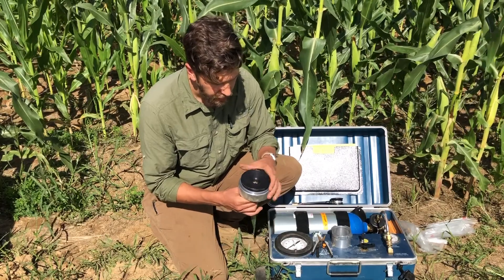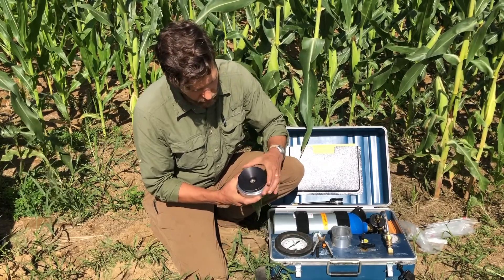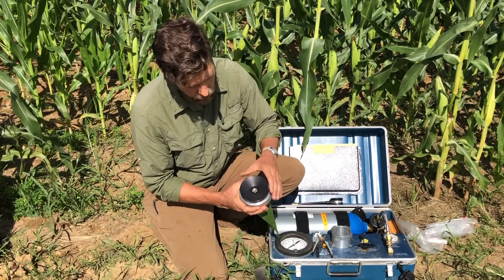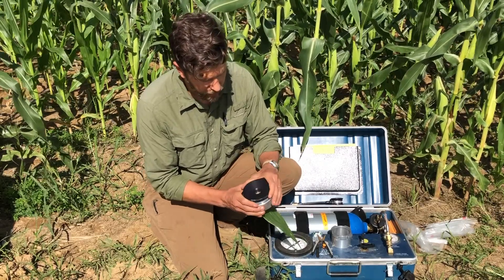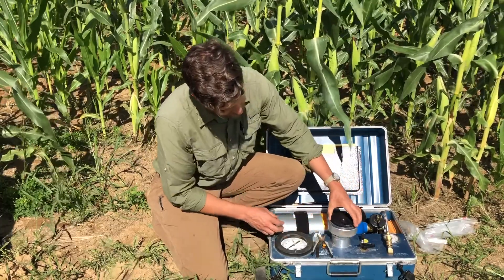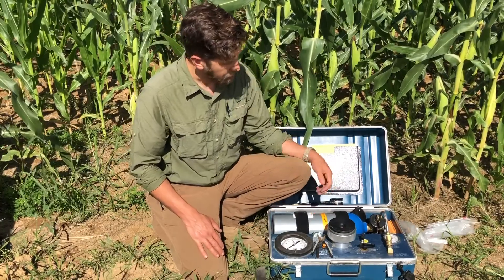There's a gasket that runs on either side of this leaf sample. We don't want to crush the sample, but we just want a very nice seal so there's no pressure escaping from the hole between the surface of the leaf and that rubber gasket. So I'm just carefully tightening that — not crushing the sample, but ensuring a good seal. Then we're going to lock our lid into place and begin our measurement.